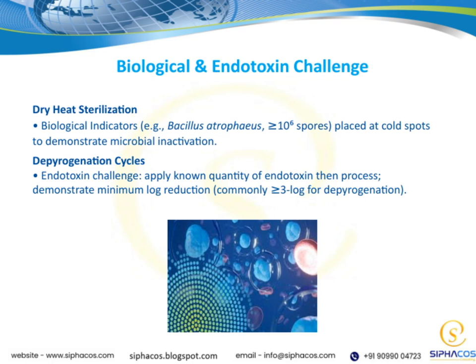Connecting these points to the overall theme, both biological indicators and endotoxin challenges are essential for validating that dry heat sterilization is effective, not just against microbes, but also against pyrogens. They help us ensure the highest standards of safety in our sterilization processes.